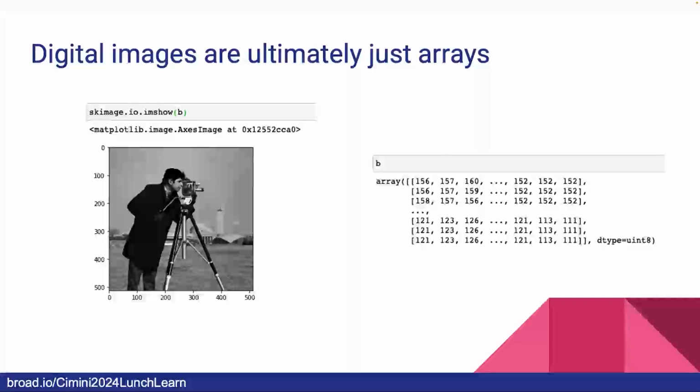You have 4 million data points every single time you snap that camera. And that's true for multiple channels and multiple z-planes and multiple time points. So you end up with sometimes billions or even trillions of points of information that for the most part don't really get used quantitatively. This is going to mostly set up the third part of my talk, but I want to introduce this idea now: what we're looking at are not actually pictures, they're arrays.